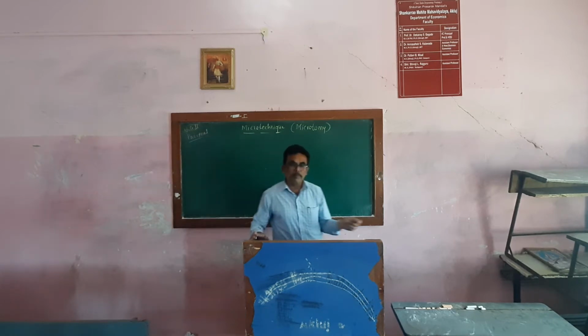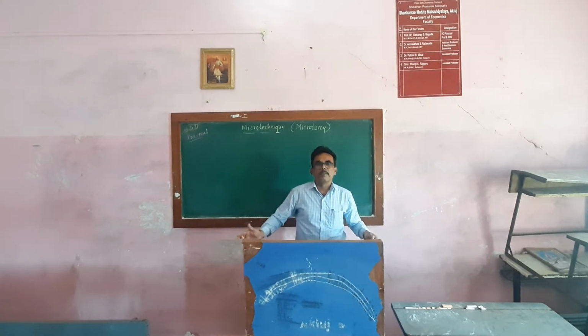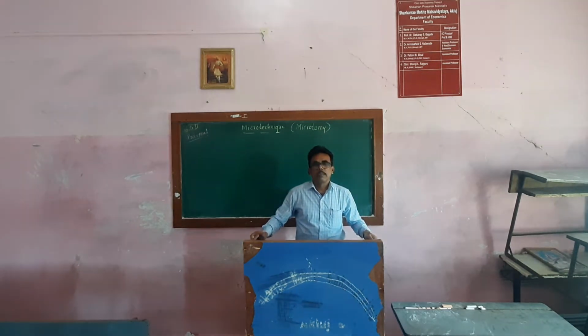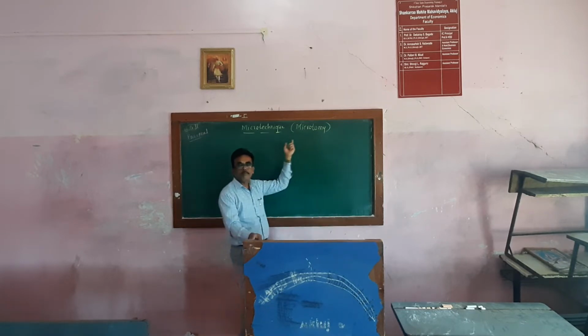Here, suppose you take a rat tissue, we can use it for microtomy.